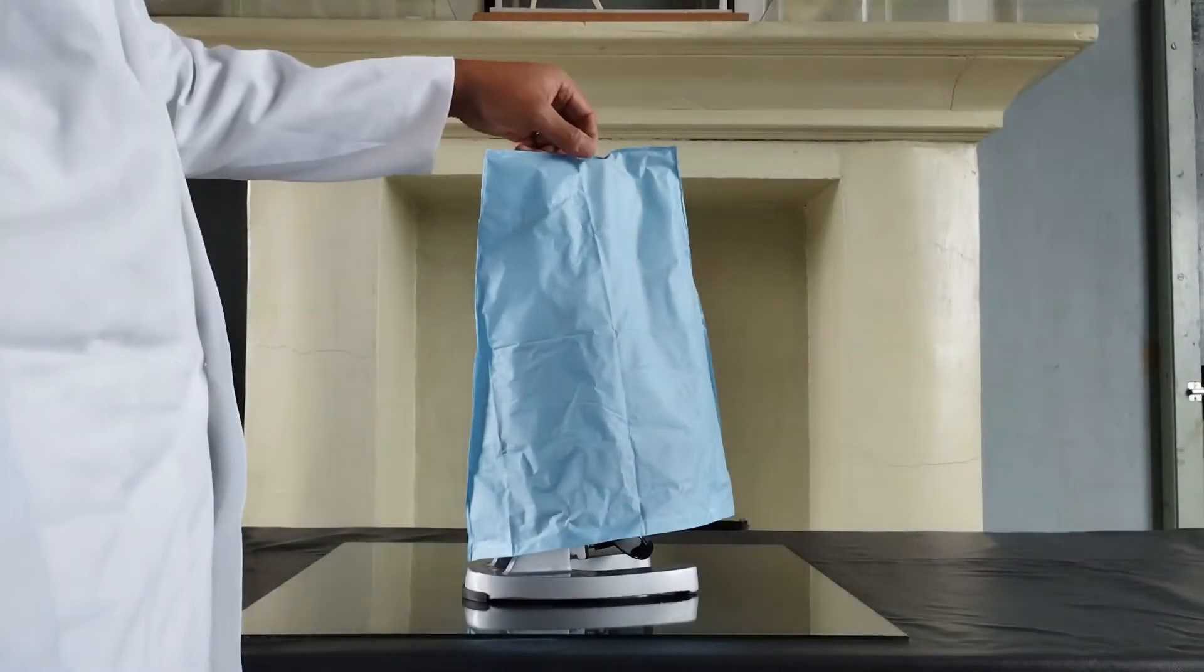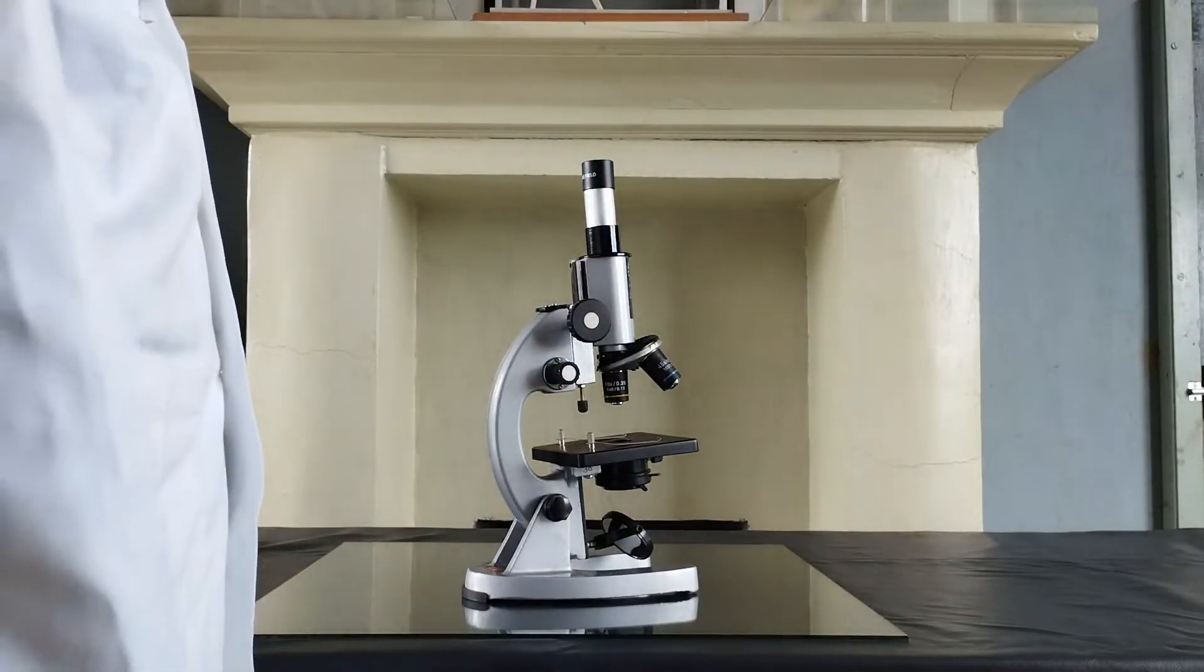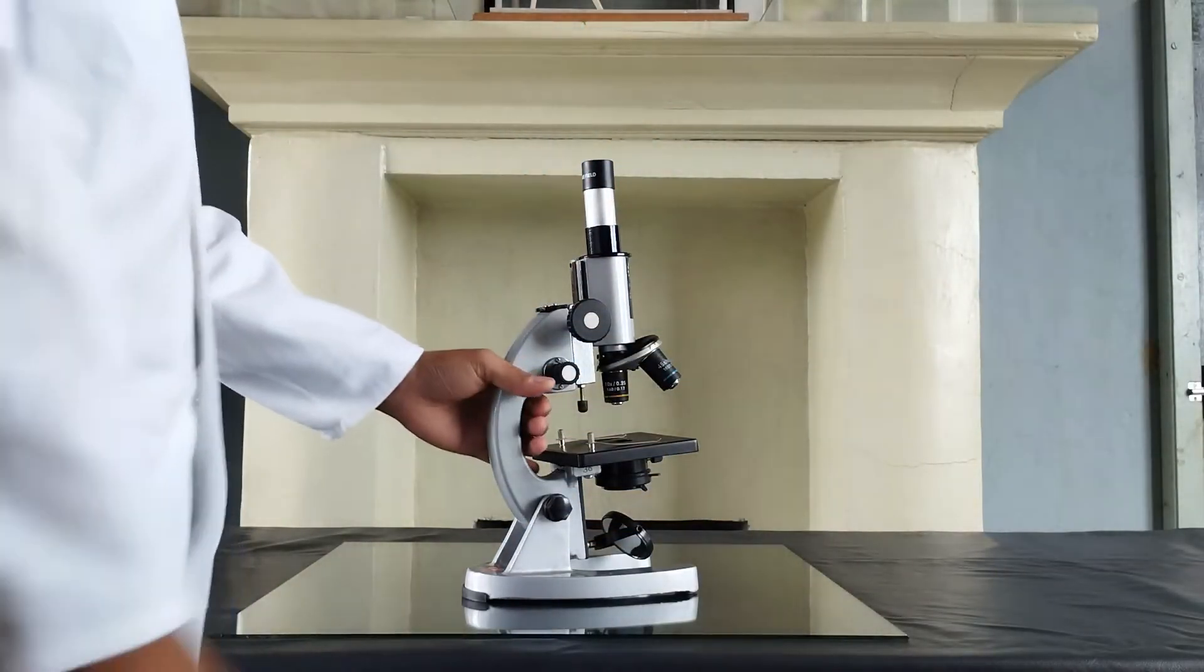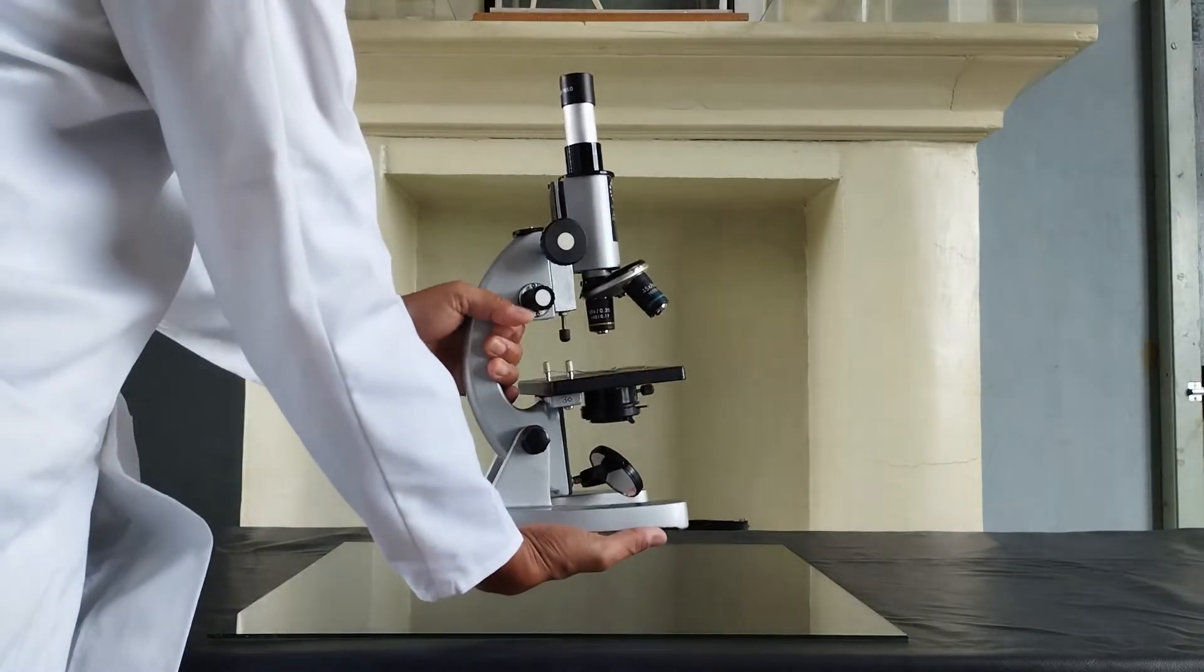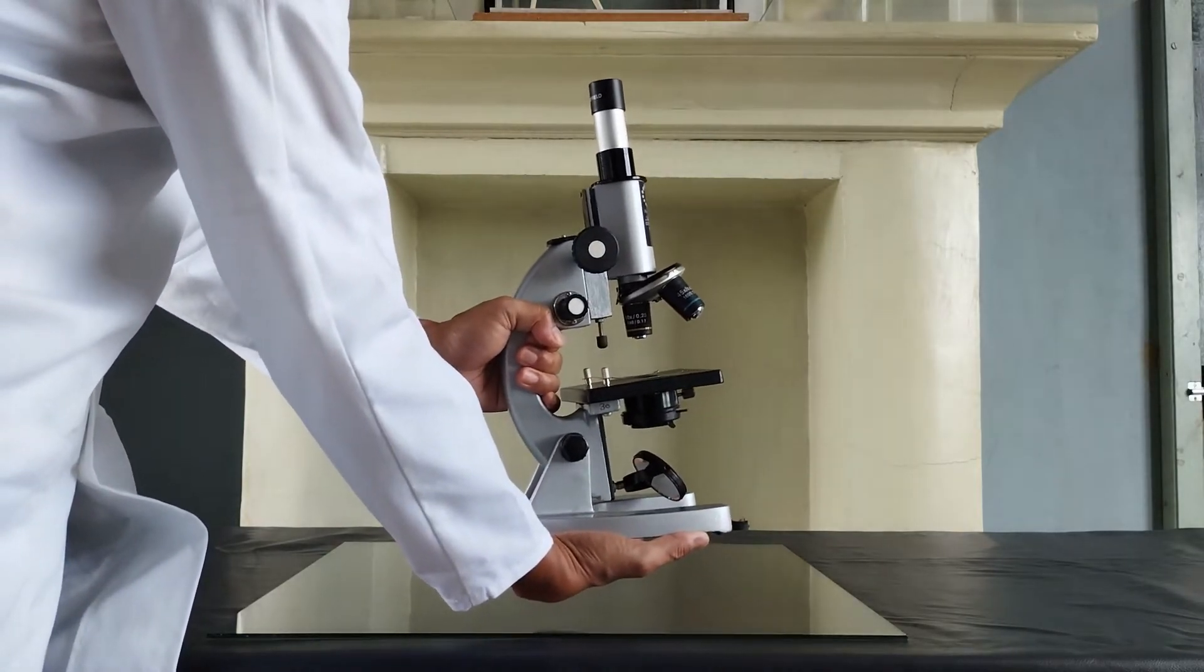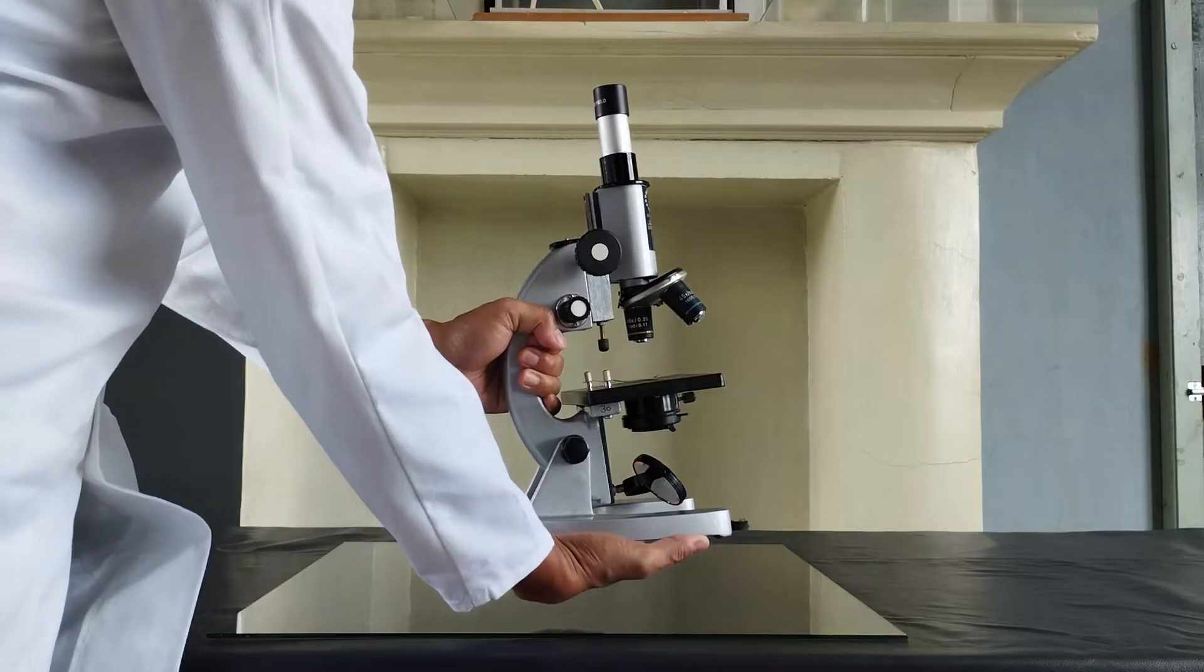Once you remove the microscope from its box, bring it to the working table by holding it with both hands, one hand firmly holding the arm of the microscope and the other hand supporting the base of the microscope, like so.